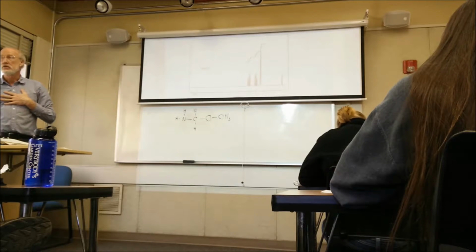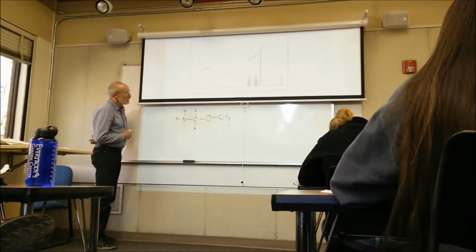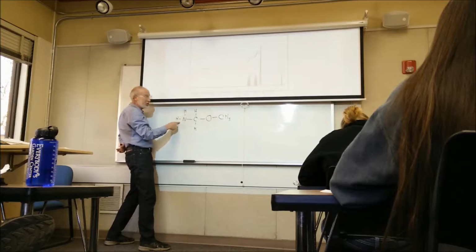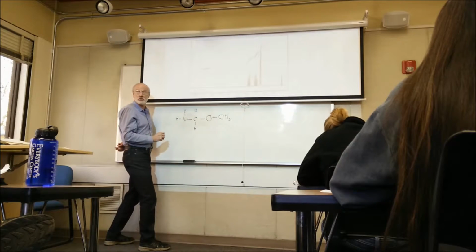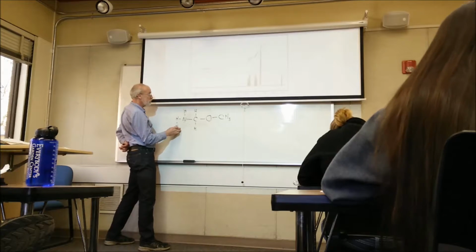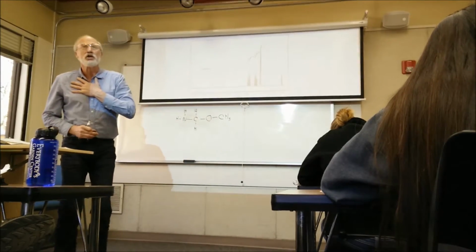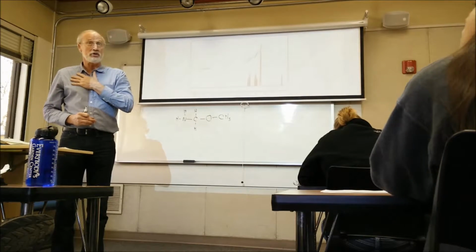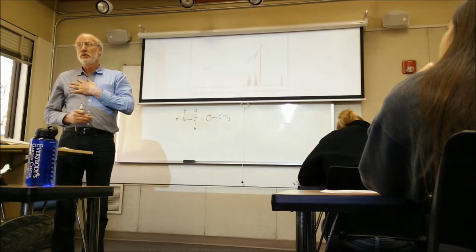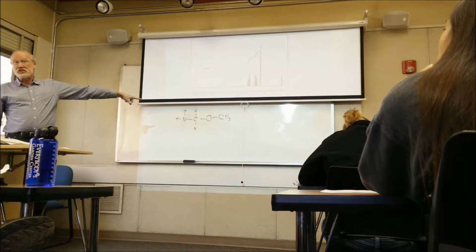So which series of peaks is the NH2? The NH2 is most likely this one because N is more electronegative than carbon, and that's going to de-shield these protons more than the carbon de-shields those two. Okay. But that CH2 is going to be shifted to the left by both the nitrogen and the adjacent oxygen, right? That's true. So it's not abundantly clear which one of the peaks belongs to which one of those pairs of protons. But we could look that up. Yeah, but you don't need to because this is the only thing that's consistent with that spectrum.